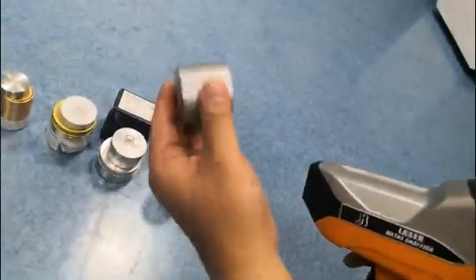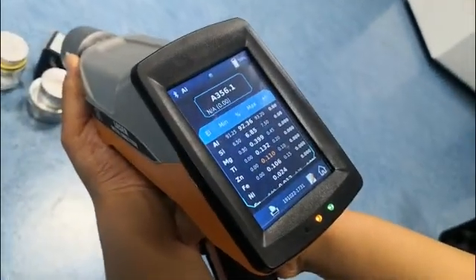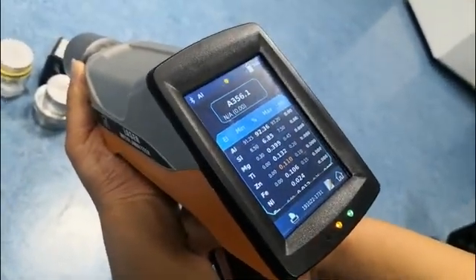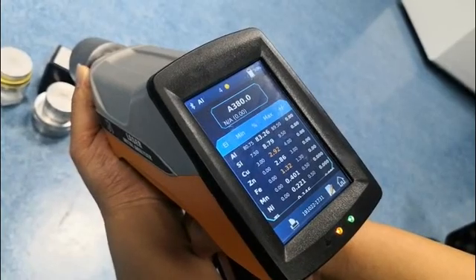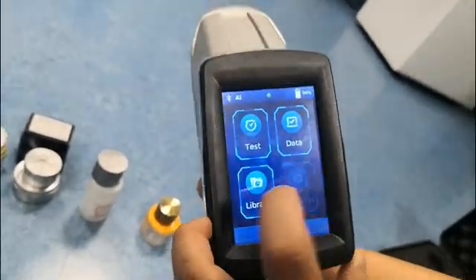We move to another sample. This is 3880. Okay, now we move to copper base.